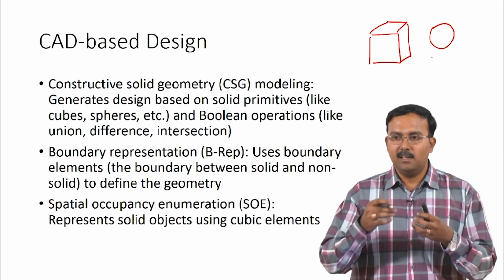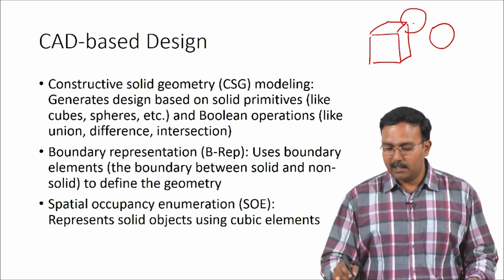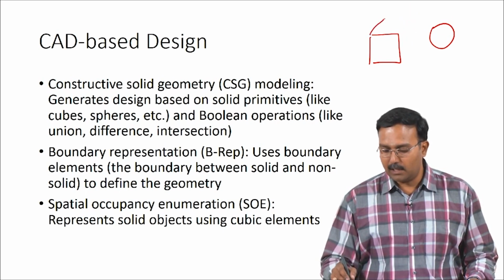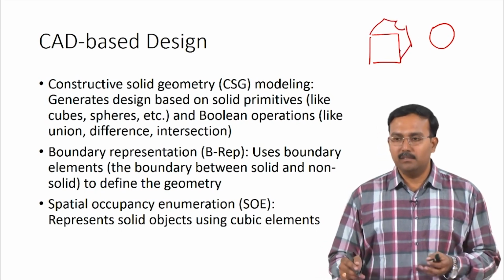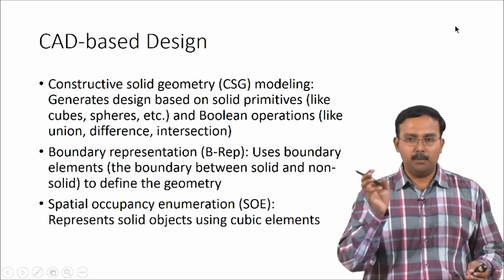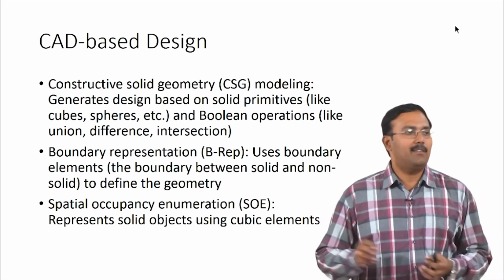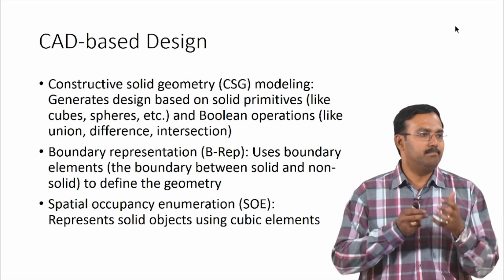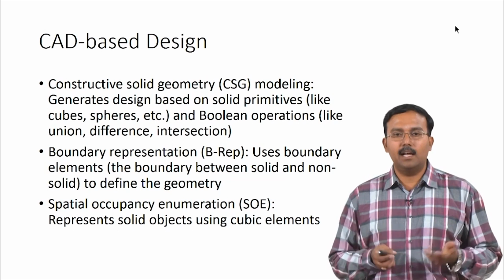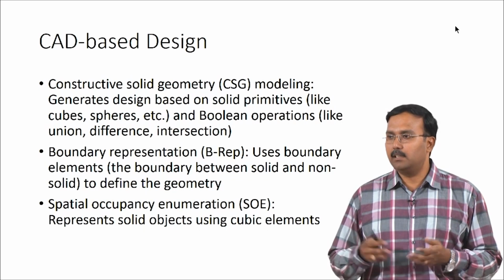Now you can actually combine these two in different ways to get different structures. You can actually add these and you would get something which basically has a sphere here, or you could deduct this and delete this and you will end up having something like this, where you have this as the structure, right. So, it is possible to do either of this, and you can also have an intersection which will only be a portion of the sphere and so on. So, this is just for sphere and cube. You could have other solid primitives which you can bring combinations thereof using Boolean operations to get different internal architectures, which can closely resemble what you would see in a real tissue.